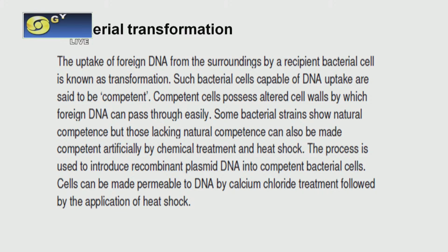But the last part of the experiment is the preparation of competent cells and bacterial transformation. Now, why do we need this experiment? Whether your ligation reaction is successful or not can be monitored only through transformation. Moreover, what is the purpose of knowing transformation? Supposing you need to incorporate a plasmid DNA in a bacterial cell, in that case you have to undergo transformation. What is meant by transformation? It is the uptake of foreign DNA by a bacterial cell.